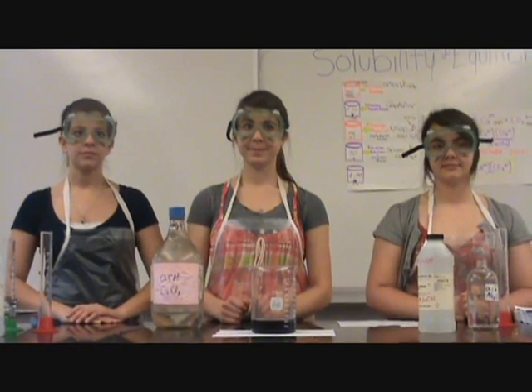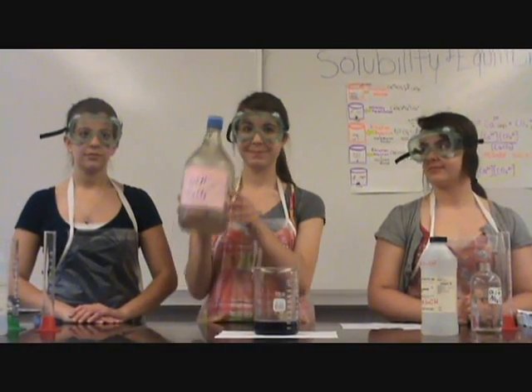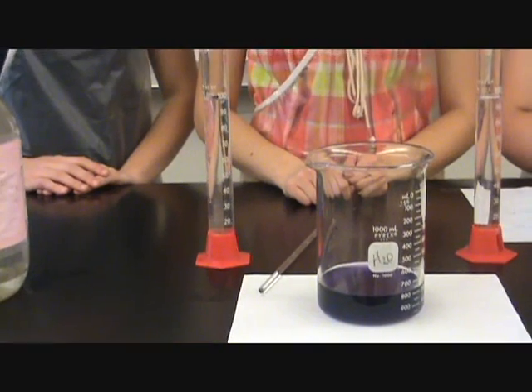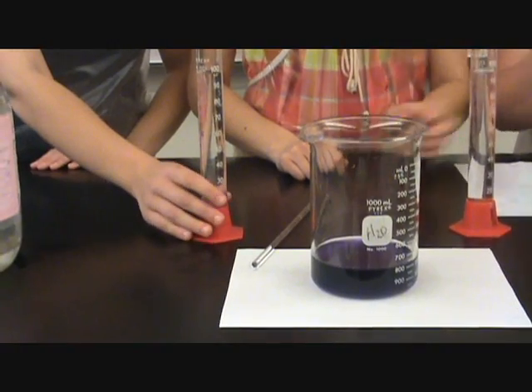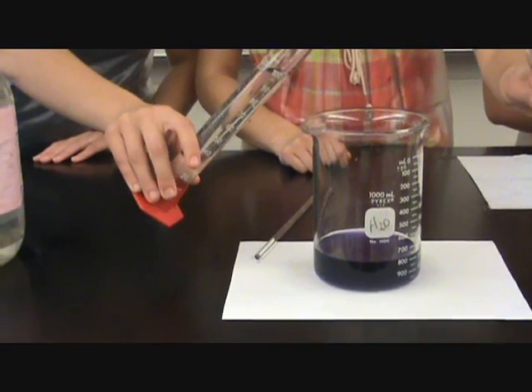Now we will add calcium chloride. Since most carbonate salts are insoluble, this reaction will form a precipitate, calcium carbonate.